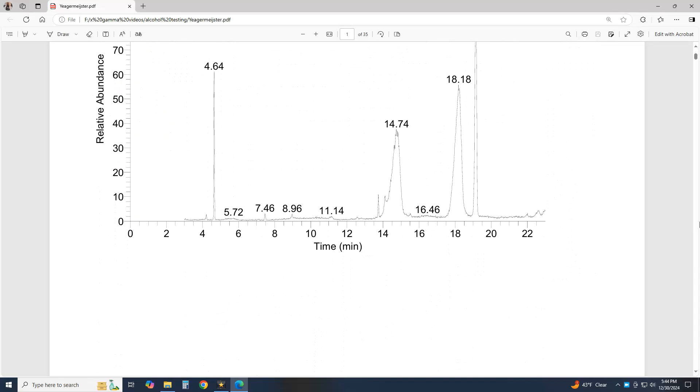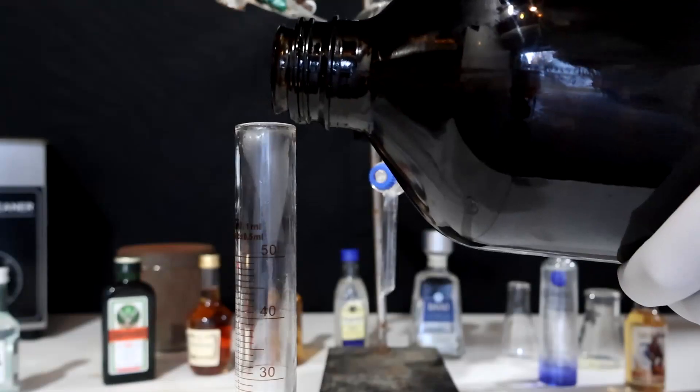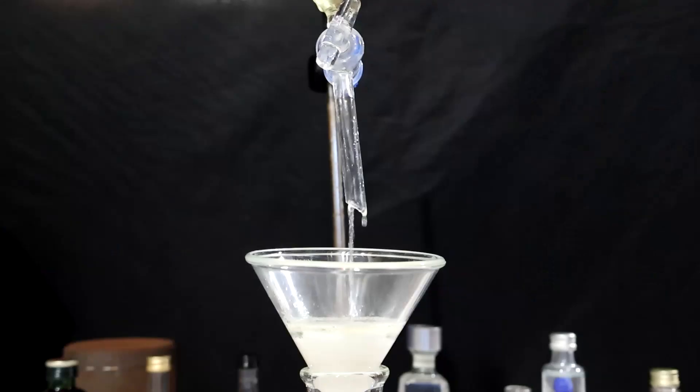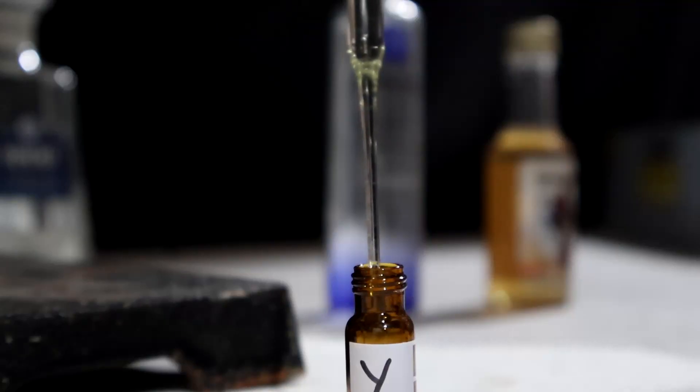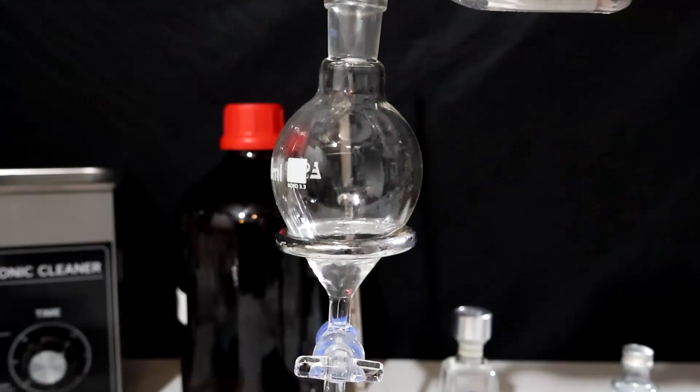There's some preparation work involved since the GC does not like water and liquors have quite a bit of water in them, which is why they are such healthy drinks.